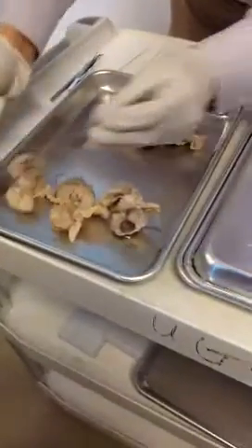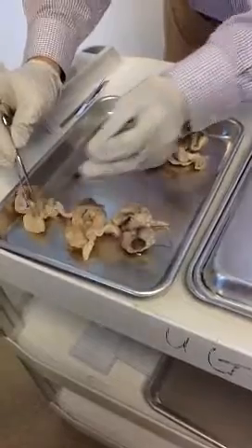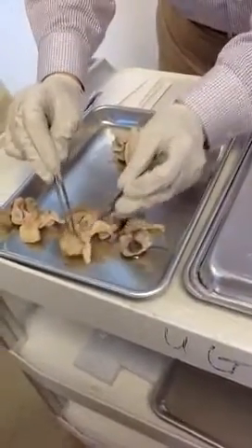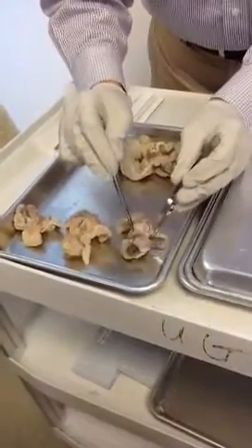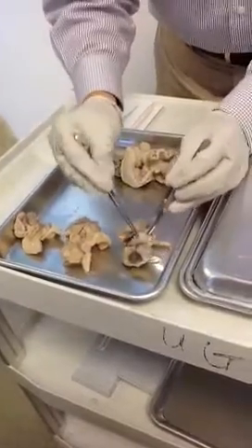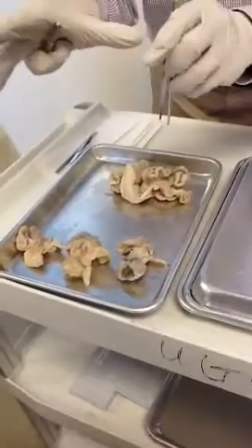I'll show you three types of ovary. This one looks like it is not in the ovulate stage. This one has a follicle here — it's almost going to ovulate. And this one is just right before ovulation. You can see it's very, very big. Different from humans, each time they can ovulate more than one egg.